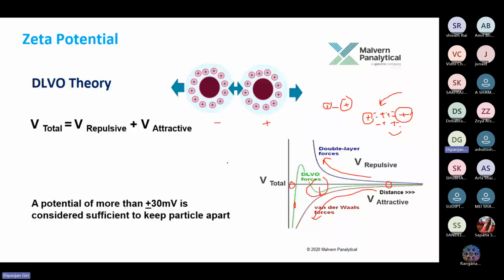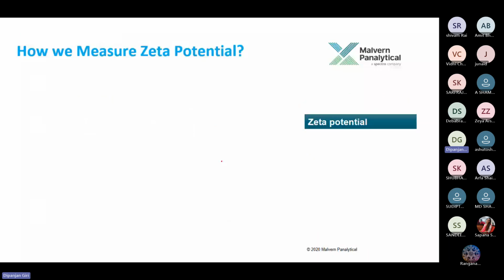So now the question is how we measure the zeta potential. Zeta potential measurement is a very complex process.